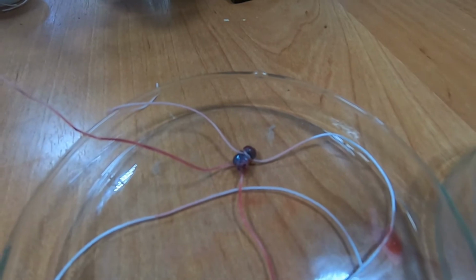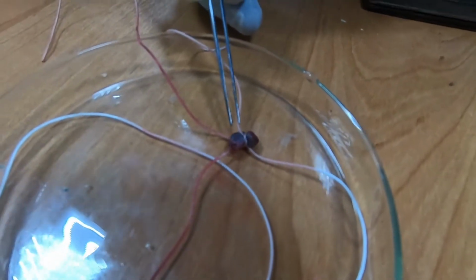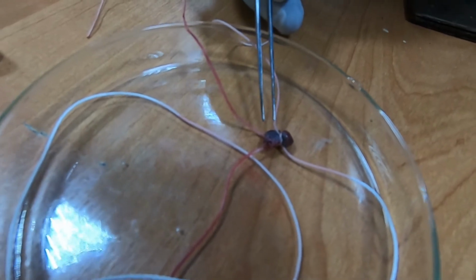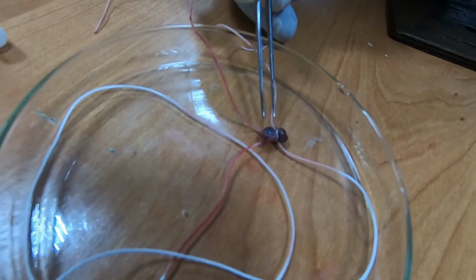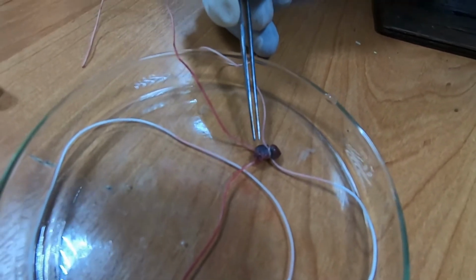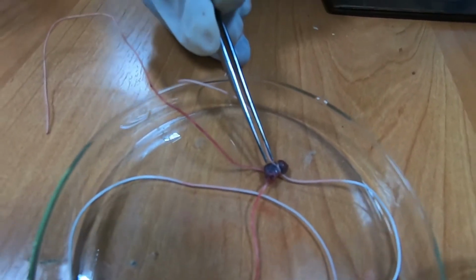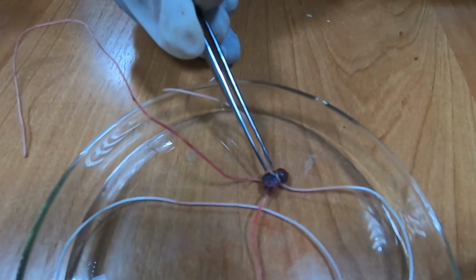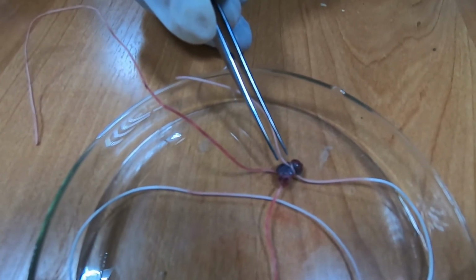It's not beating. This is to show you that this is where the energy impulse is being formed constantly until the whole organism dies off. Before then, cells here are being multiplied and regenerated all throughout the life of the organism. This is what happens to our heart.